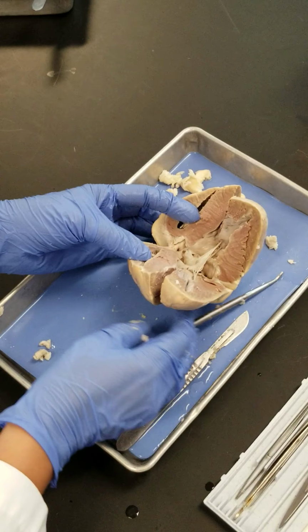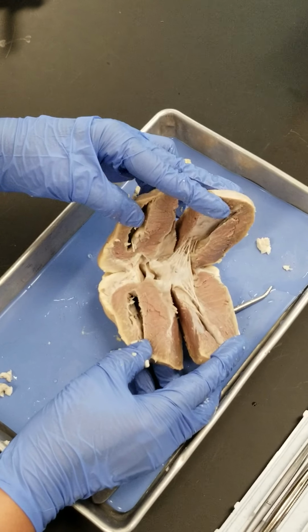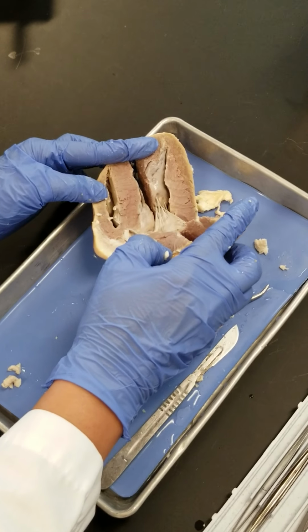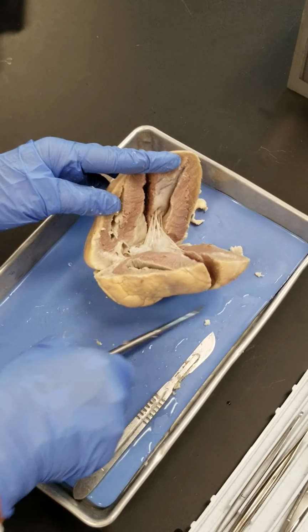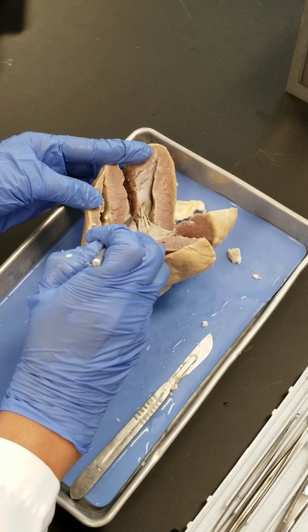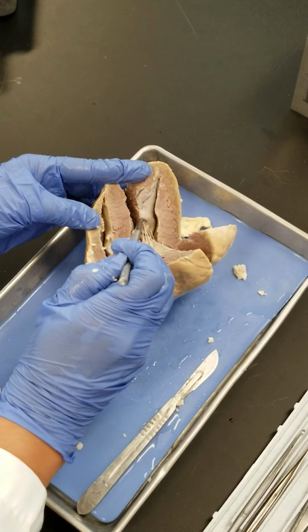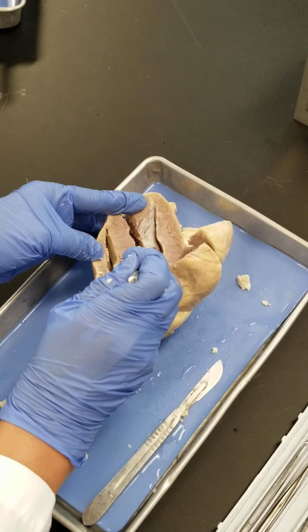Now let's go over the structure of one valve. It's actually very good. Can you take a picture of that? Very good. You see the valve? You see the tendon-like structures that are connected to it. What do we call them? Chordae tendineae. You see the muscles that these chordae tendineae are attached to.